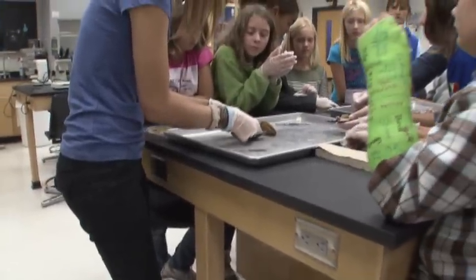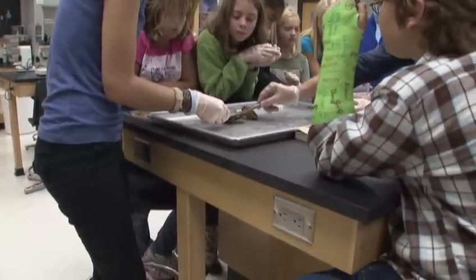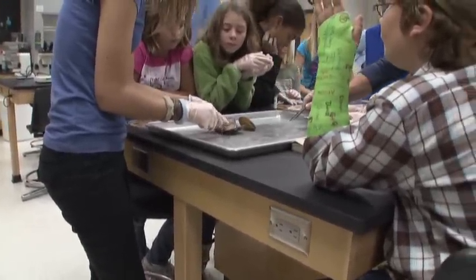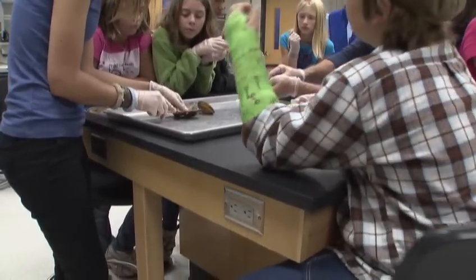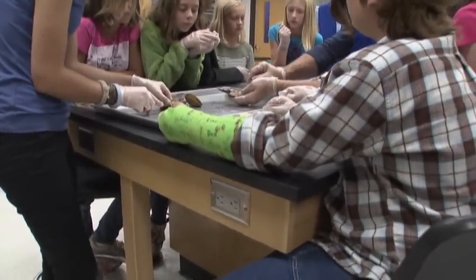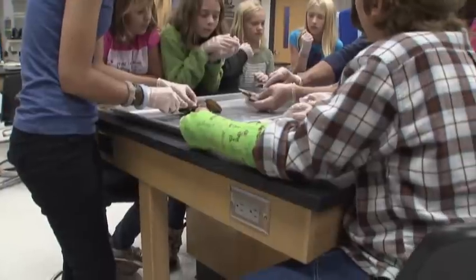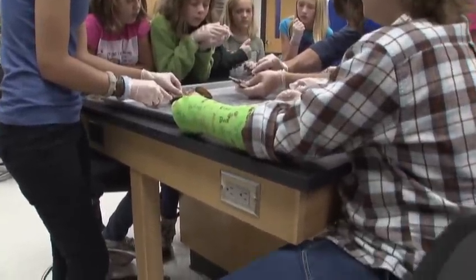Okay, so if you can look at that. Now in here, this is called the visceral mass right there. And there's an intestine. You can see little tubes that go through there. Actually, it's so weird because after that intestine goes up here, it goes up through the heart. Right there is where the heart is. The intestine goes through the heart. Can you imagine that? Weird. So it's right in there.